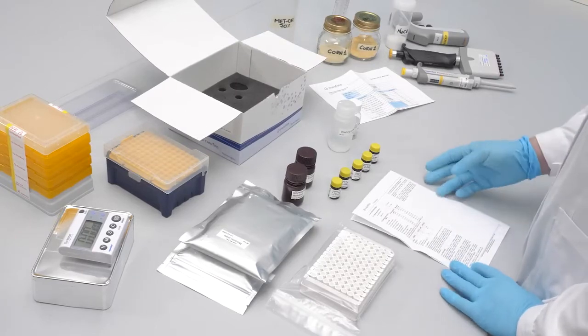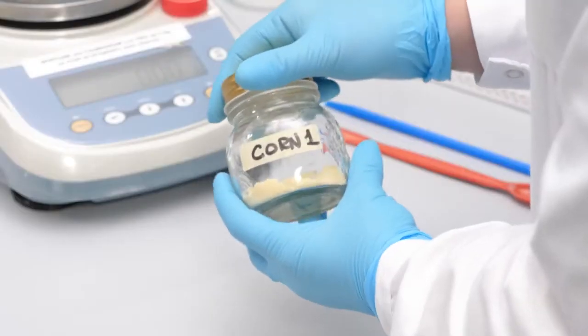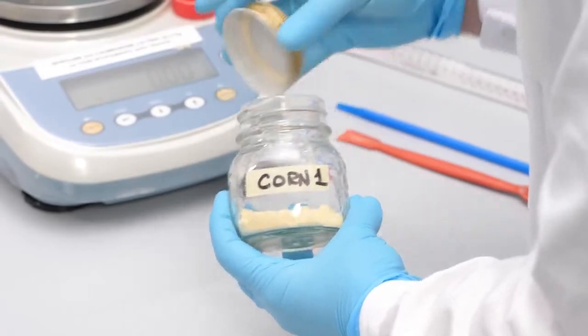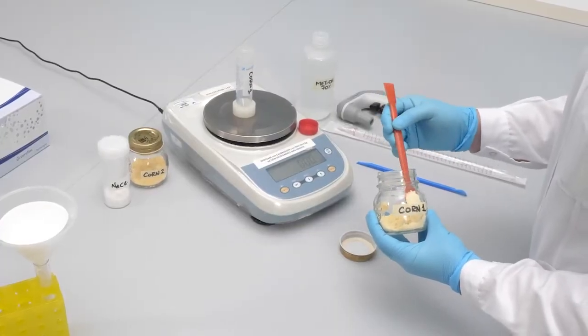A common fast methanol-based sample preparation is shared for cereals analysis, thus enabling a flexible multi-mycotoxin research.